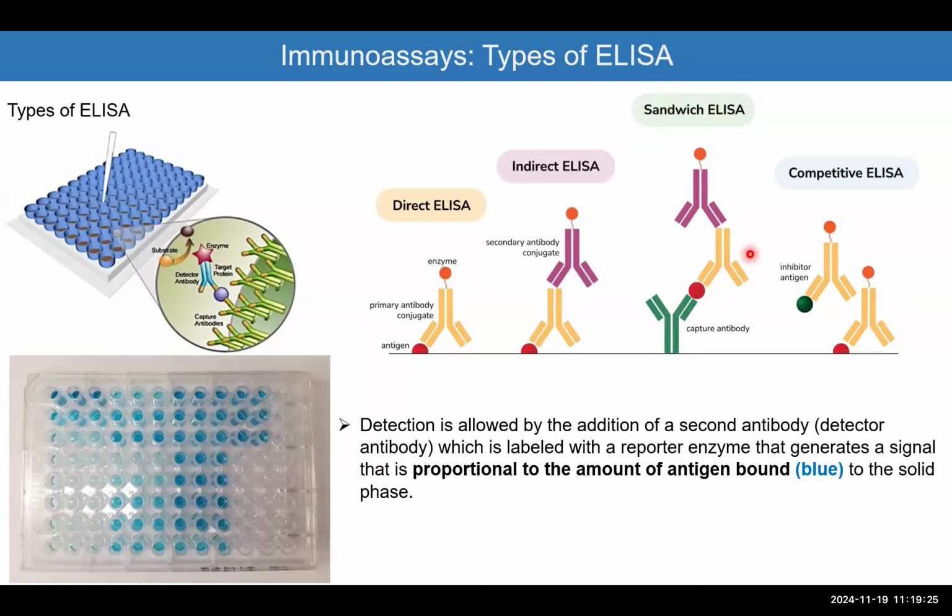And finally, you have the competitive ELISA where you have two different antibodies that detect two different antigens. This is a little bit more complicated for you guys. I'm not going to go into it.